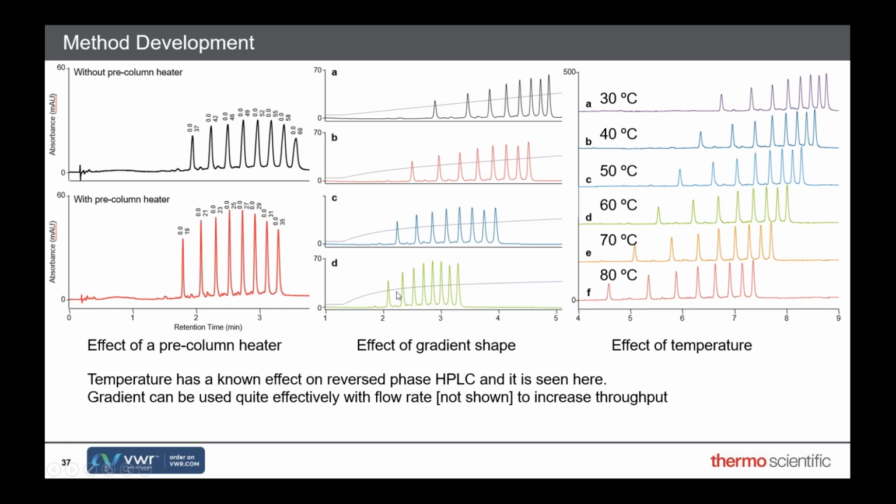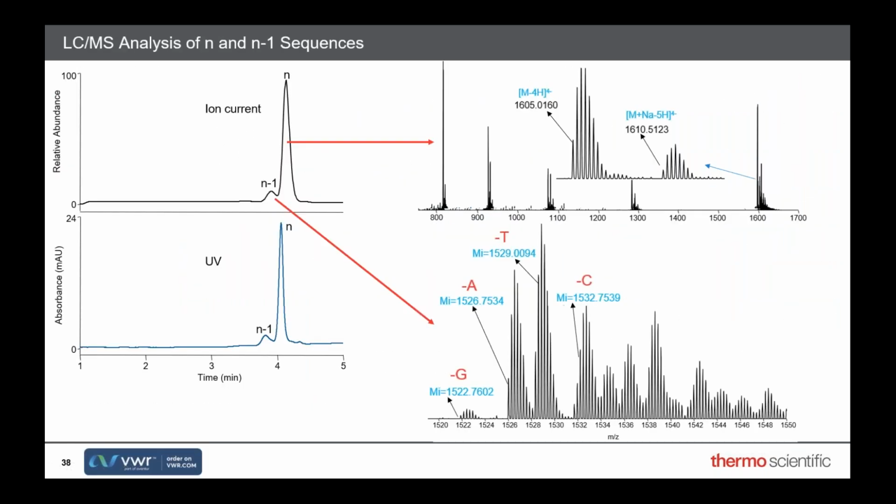If you're using a polymeric separation or you want to separate a lot of N+1s, the earlier separation is easier to do than the one at the back. So you will flatten the gradient out at the back and speed it up at the front with a curved gradient. They can be quite powerful. But in normal circumstances, if you've got a synthetic product of mainly one length, you'll optimize a linear gradient along the area where your oligonucleotide will elute. And this is the effective temperature, and it's exactly what you'd expect. As you increase the temperature, you lose retention. It gets nearer and nearer in.